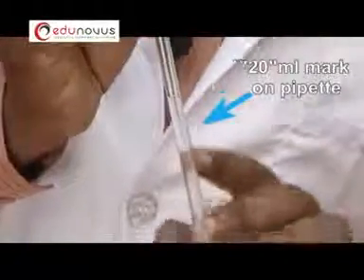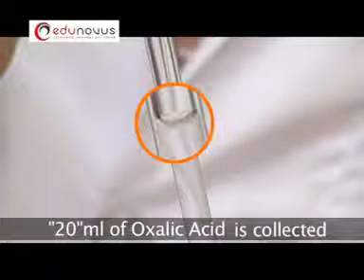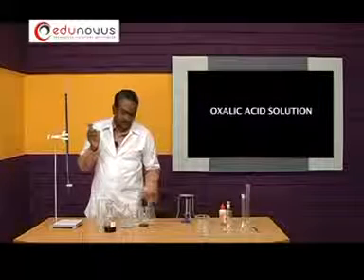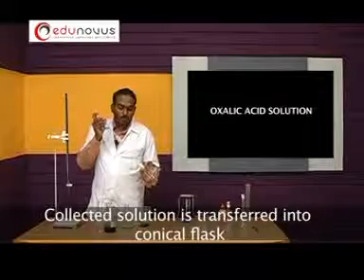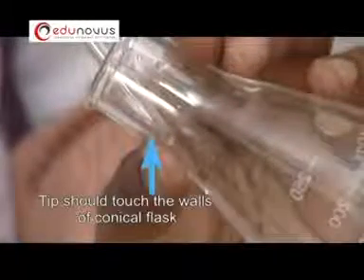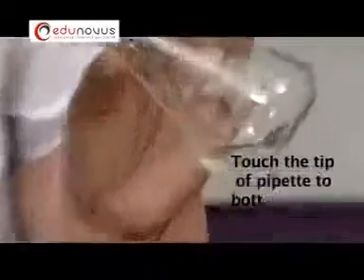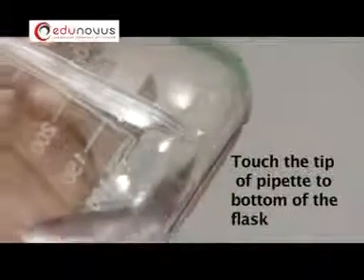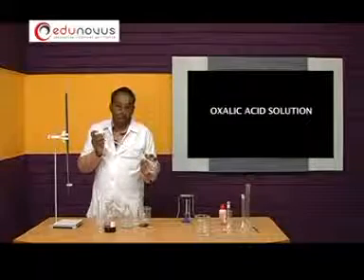Now check the level of oxalic acid up to the mark by using the face of the forefinger. 20 ml. Release the oxalic acid into the conical flask by touching the walls of the conical flask. Now touch the tip of the pipette to the bottom of the conical flask. Therefore, if any droplets are present, they are released into the conical flask.